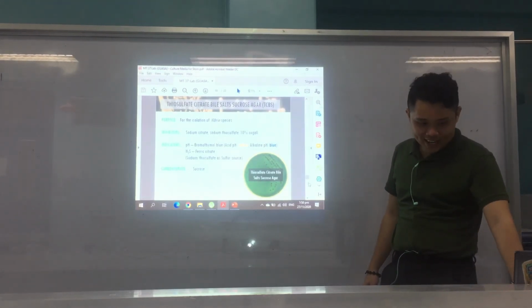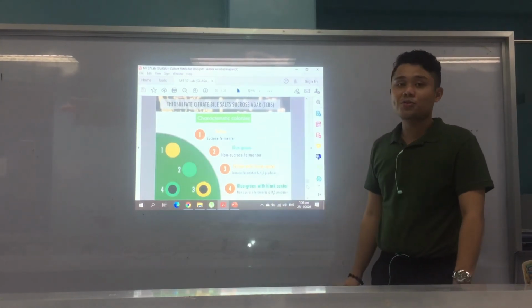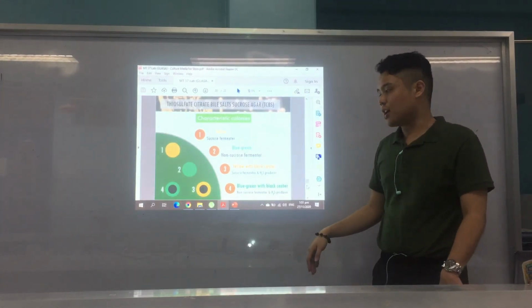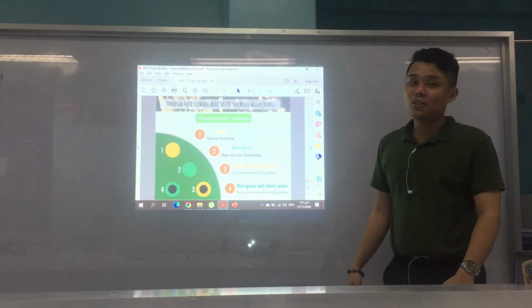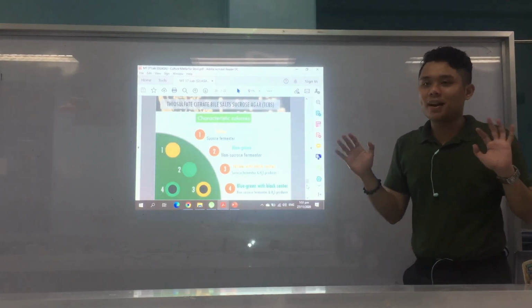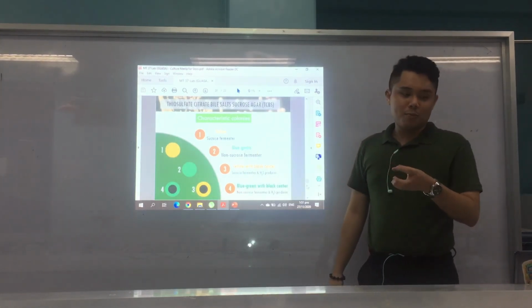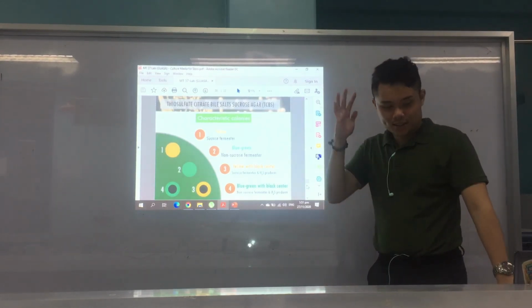Ayan. Sorry, it's really hard when it's not PowerPoint. Okay. For characteristic colonies: yellow, of course, sucrose fermenter. Blue-green, non-sucrose fermenter. Yellow with black center, sucrose fermenter and H2S producer. And blue-green with black center, non-sucrose fermenter and H2S producer. So as you can see, I hope you can correlate. Basically, the black parts usually mean it produces H2S. And then the different colors, depending on the pH indicator, show whether it ferments or not. Okay? So I do hope the connection makes sense.